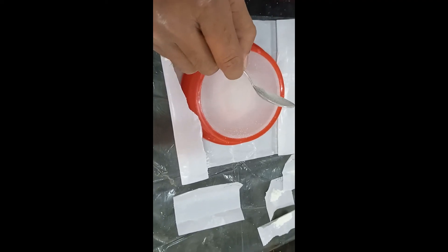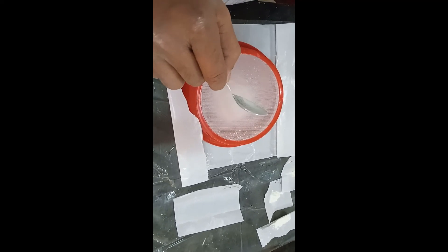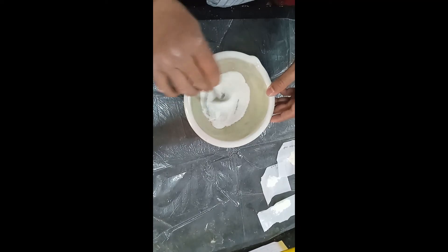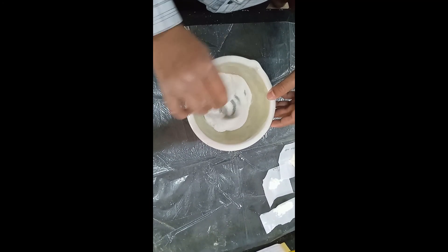So the first step is to sift paracetamol, MCC, and PVPK30. Now the second step is the mixing of the paracetamol, MCC, and PVPK30.